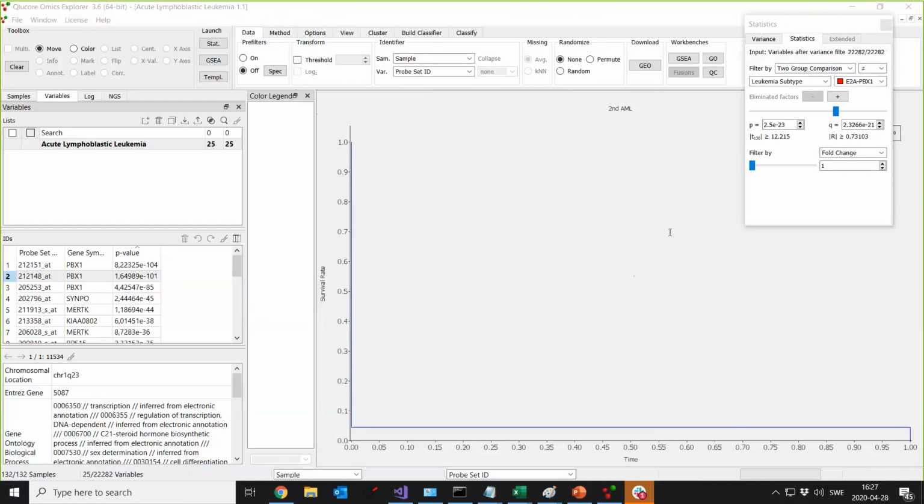Here's another question for someone else. I want to know if you apply variance and optimization. You want to know how to apply variance and optimization in the statistics tab. Okay.